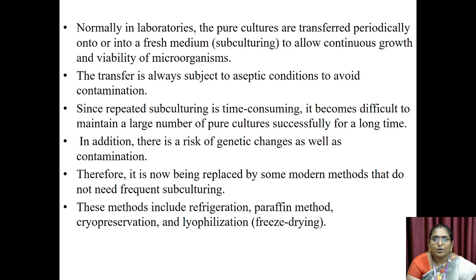Normally in laboratories, the pure cultures are transferred periodically onto or into fresh medium, that is subculturing, to allow continuous growth and viability of microorganisms. The transfer is always done under aseptic conditions to avoid contamination. Since repeated subculturing is time consuming, it becomes difficult to maintain a large number of pure cultures successfully for a long time. In addition, there is a risk of genetic changes as well as contamination. Therefore, it is now being replaced by some modern methods that do not need frequent subculturing.